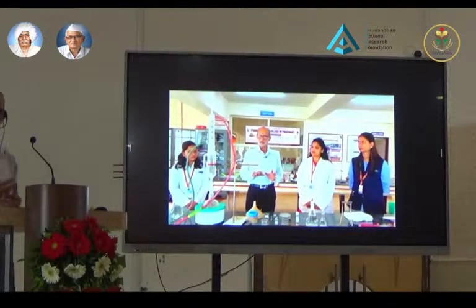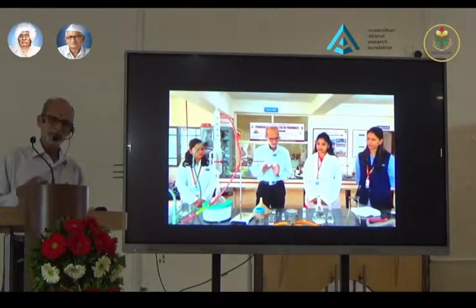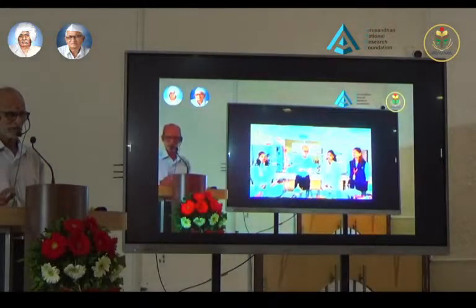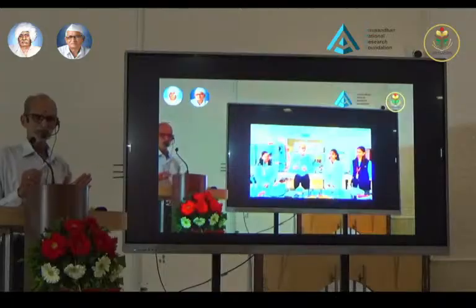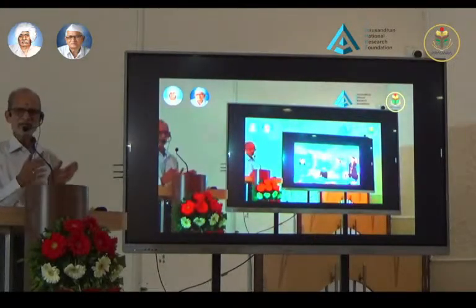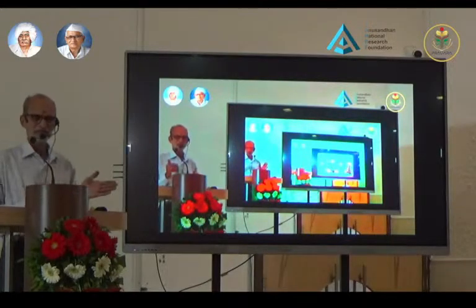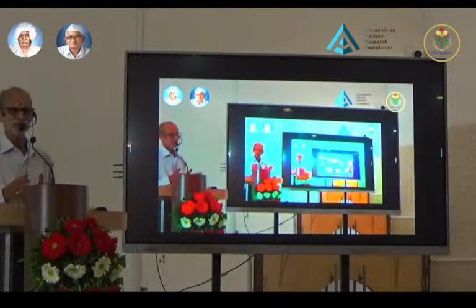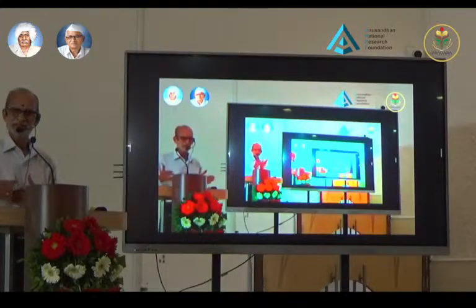Powdered Embelia ribes fruit is extracted with petroleum ether. Now, embelin as such is not soluble in petroleum ether, but still we use petroleum ether for the extraction. The reason is that Embelia ribes fruit contains seed inside, the seed has lipid inside, and lipid is soluble in pet ether. Embelin is soluble in lipid, and lipid in turn is soluble in pet ether, and that is why, though embelin is not soluble in pet ether, we still use pet ether as an extracting solvent.